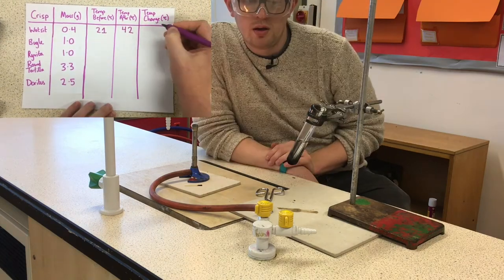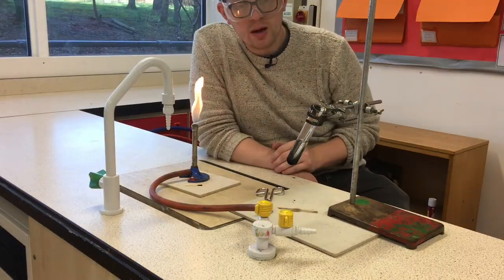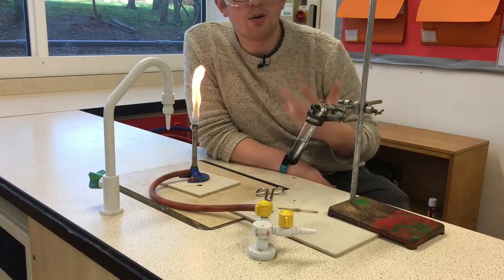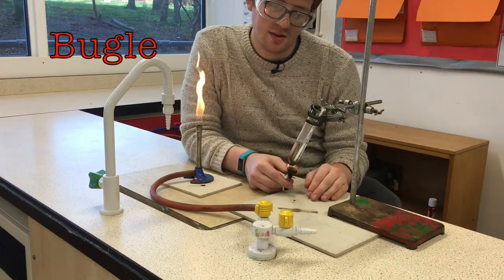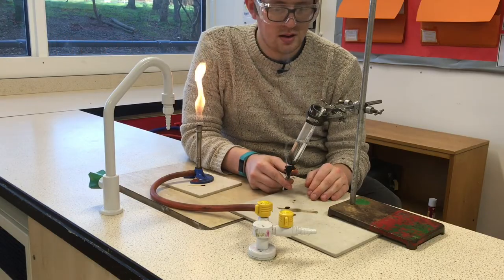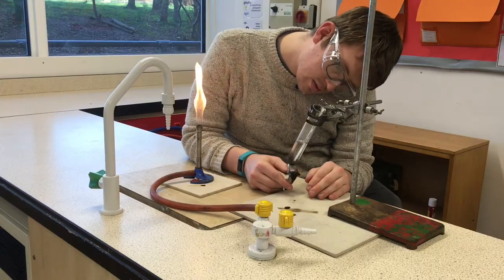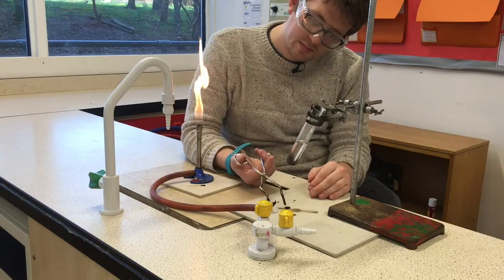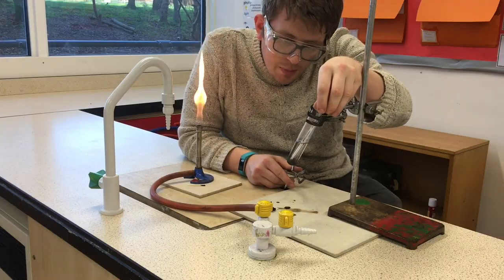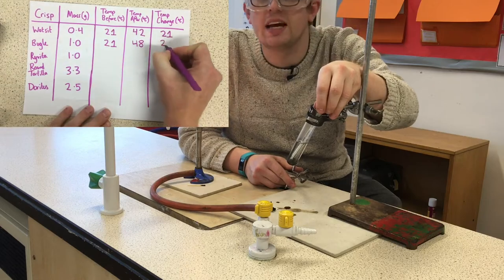So that's our first crisp — 42 degrees reached. We're going to repeat that for the other types of crisp and see how much heat energy has been transferred from the chemical energy. Again we're looking to see when it doesn't want to go up anymore, and I make that 48 degrees for the second crisp.